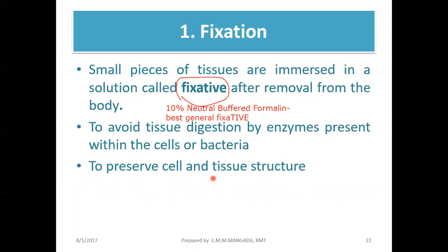So, we have to preserve it, okay? That is preserving the tissue in a lifelike manner. Kung paano yung tissue natin nung nasa katawan pa siya ng buhay na tao, preserve natin yung itsura niya as well as the processes.